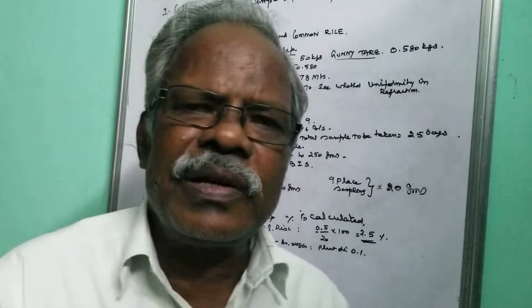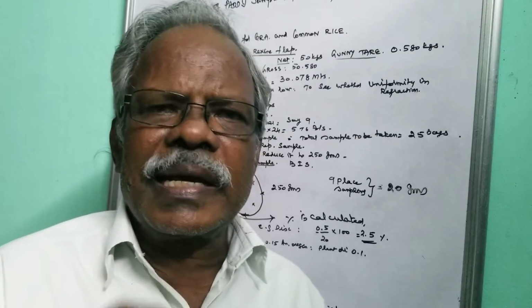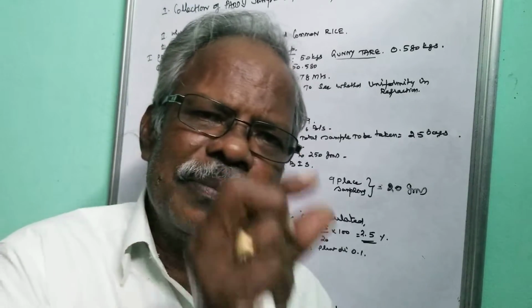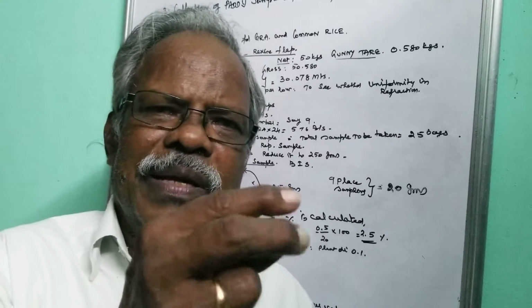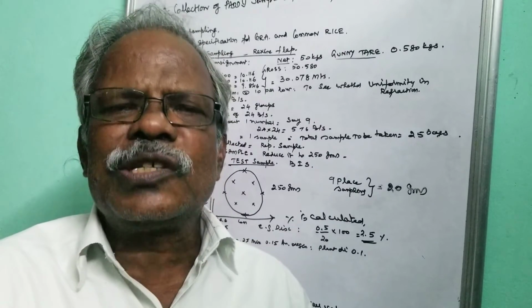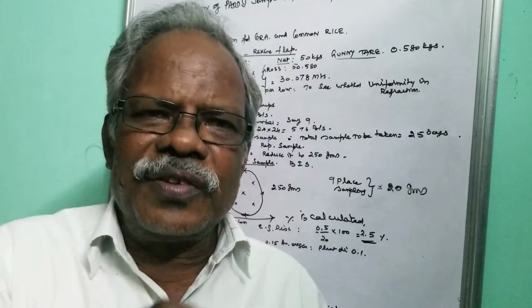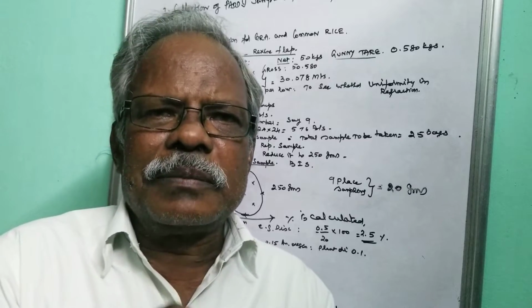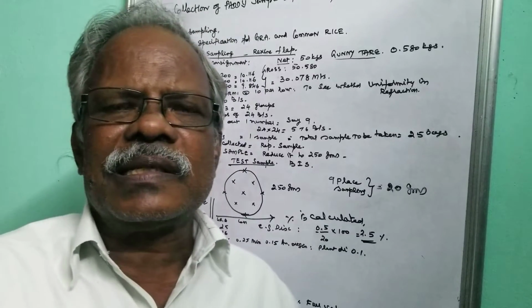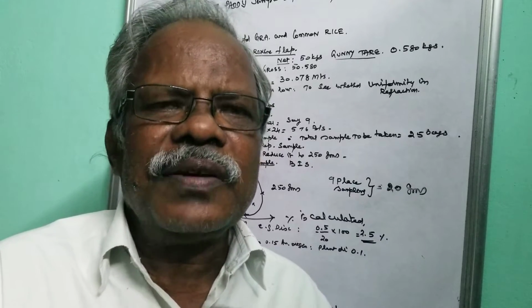Chalky will come only in raw rice, not in boiled rice, because chalky means immature grain. When it is in the paddy field, during the maturation stage, it will be in milk stage. Then it becomes hard due to maturation. When it is immature, it will be white in color during processing in case of raw rice, and if we press the rice, it will break. That sort of rice is called chalky. The chalky limit is fixed as 5. It should not exceed 5, that means for 100 kg, it should not exceed 5 kgs.